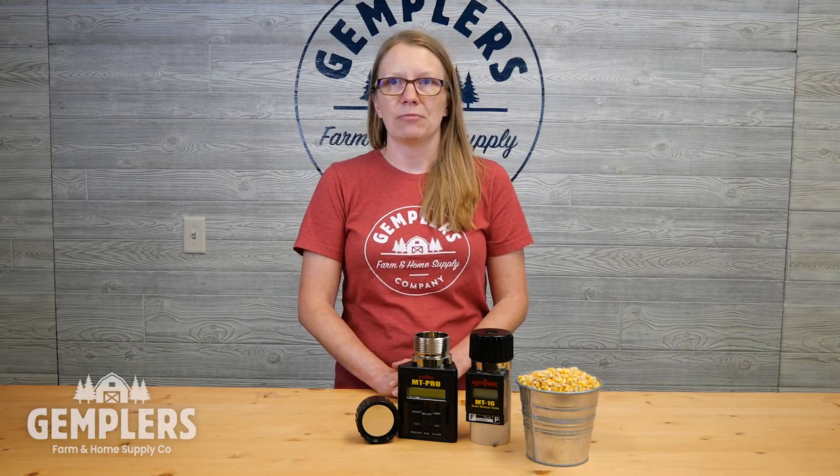Gemplers offers an assortment of portable handheld tester options, a couple of which we have here today. The ability to test grain moisture anywhere quickly and easily is the primary desire for most of our customers. Portable options also tend to be available at a more affordable price than benchtop models, and with proper use, portable testers such as these still provide the accuracy many of our customers need.